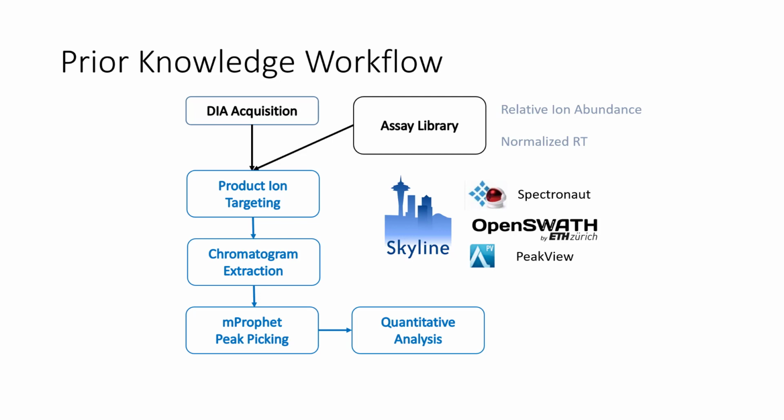And then we went to 6. So we started just like, let's see, 10, and I guess we didn't take too close a look at that, but yeah, they ranged from like 3 to 10, and then finally we said, okay, we're actually going to throw out everything that doesn't have at least 6, and we're gonna make sure that everything that had 10 only has 6.